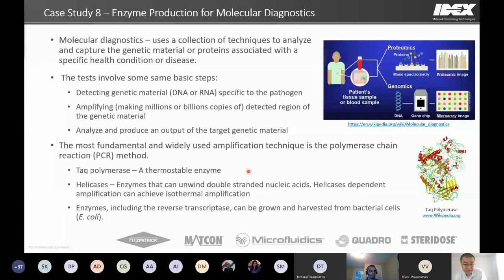The PCR basically uses rapid thermal cycling combined with an enzyme to mimic and accelerate the natural DNA replication process, in order to create many new copies of the target DNA in a short period of time. There are many suitable polymerases. One of the most widely used enzymes is Taq polymerase. It is a thermostable enzyme, so it's suitable for the thermal cycling used in the PCR process.